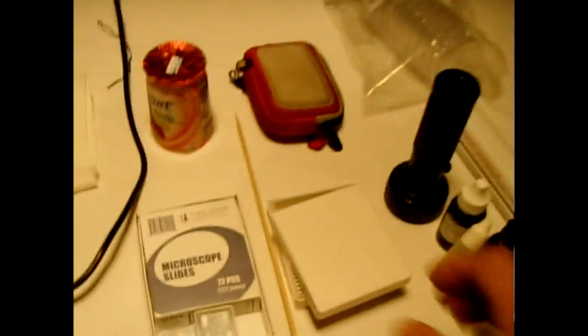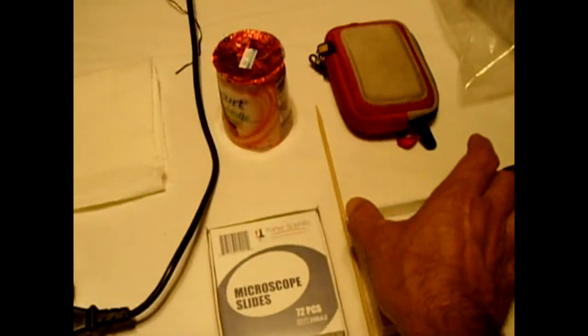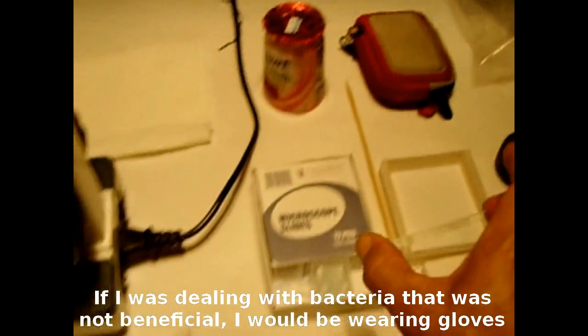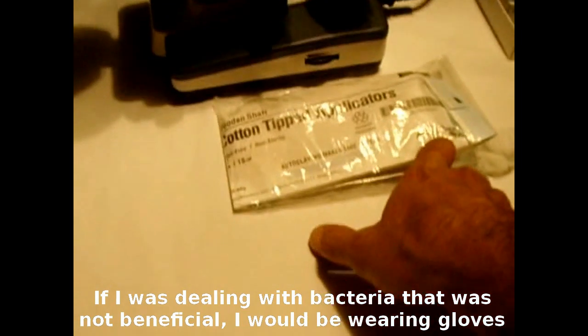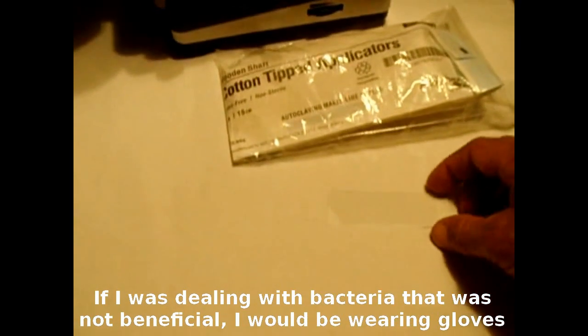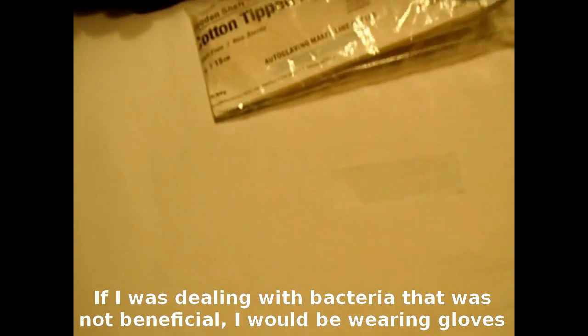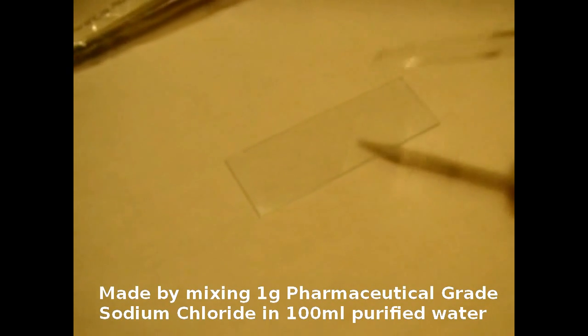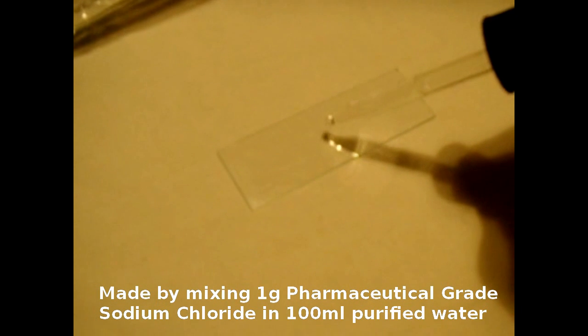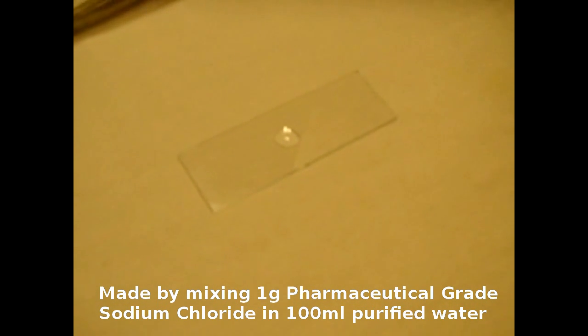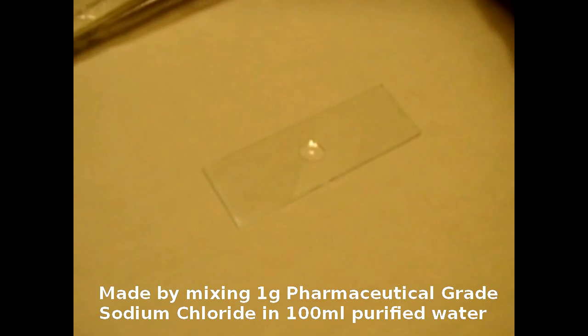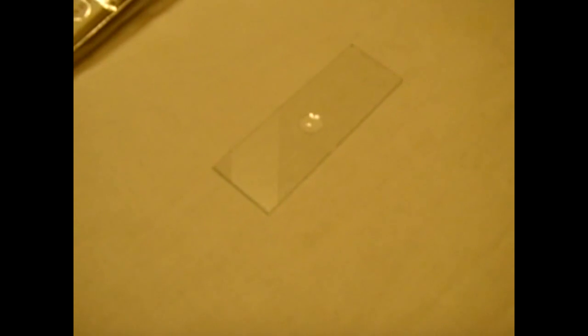Now to get started we're going to take a brand new slide, a glass microscope slide. Place it down right here, stay away from the middle of it with my hands. You can see the slide there better. The first thing I'm going to do is take a little bit of water. This is a very weak saline, it's one percent sodium chloride. Put one drop in the middle and we're good to go with that.